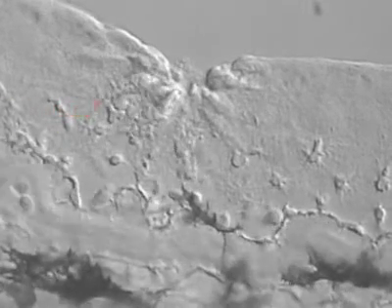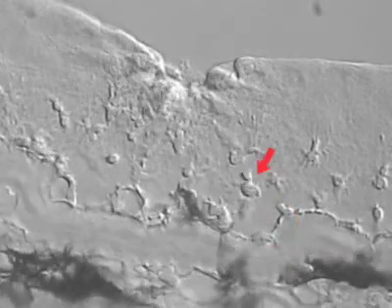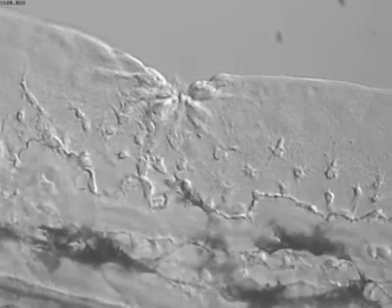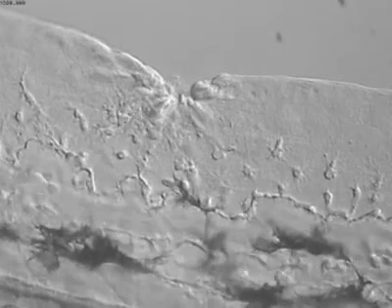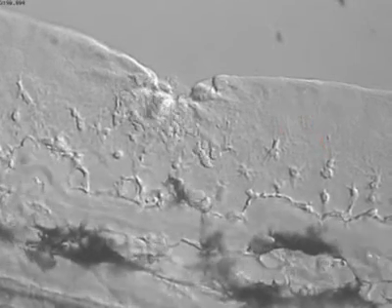They are attracted there by chemicals released from damaged cells, invading bacteria and other lymphocytes. In a zoomed-out view, we can appreciate that lymphocyte invasion is restricted to the wounded area. The static cells that are dispersed in the connective tissue are fibroblasts. In these movies, 60 minutes of real time are compressed into 15 seconds.